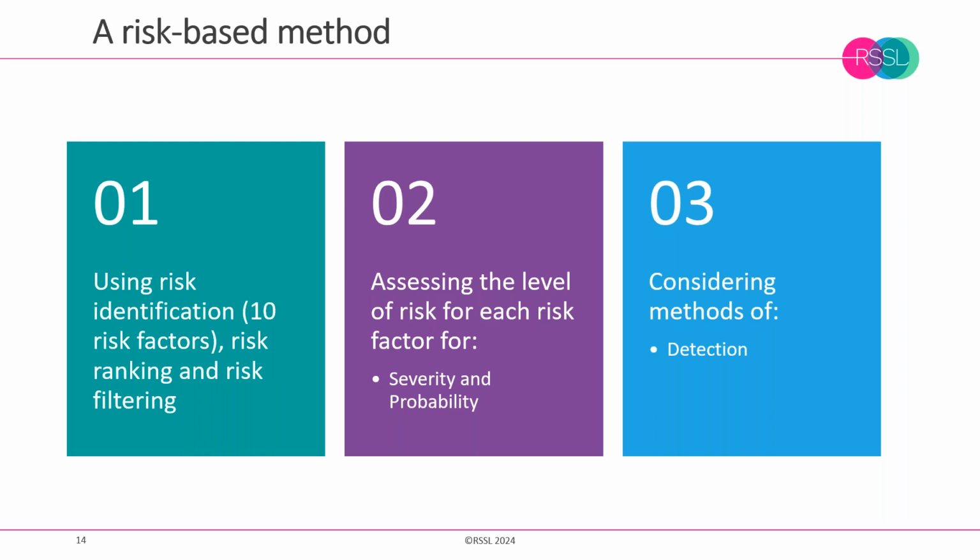So what we'll be looking at are the key factors that make up a particular production room that might increase or decrease either the possibility of there being microbial contamination, and then also the likelihood that microbial contamination will persist for a period of time or could be deposited into our pharmaceutical product. So the risk-based concepts of severity and probability are important.